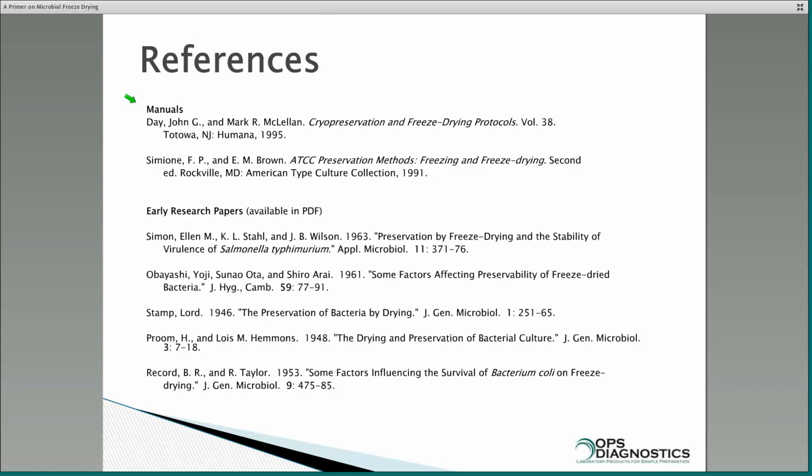I'm not sure of the question, but you can certainly grow your cells in that amount, and you can certainly resuspend it in that amount. If your cells are very dilute, then you might want to concentrate them. Or if you're going to do 6 liters, you can certainly use a larger volume of material, but for freeze drying you're going to have to dispense it, unless you have some kind of a process scale freeze dryer, which certainly exists.